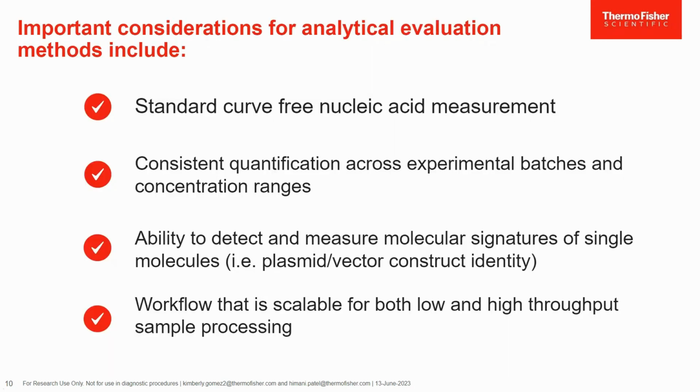So to summarize, it's important to consider conducting nucleic acid measurements that avoid the use of standard curves, provide consistent data between batches and concentration ranges, and have the ability to accurately identify and measure the presence of single molecules. Workflows should also be scalable for both low and high throughput sample processing.